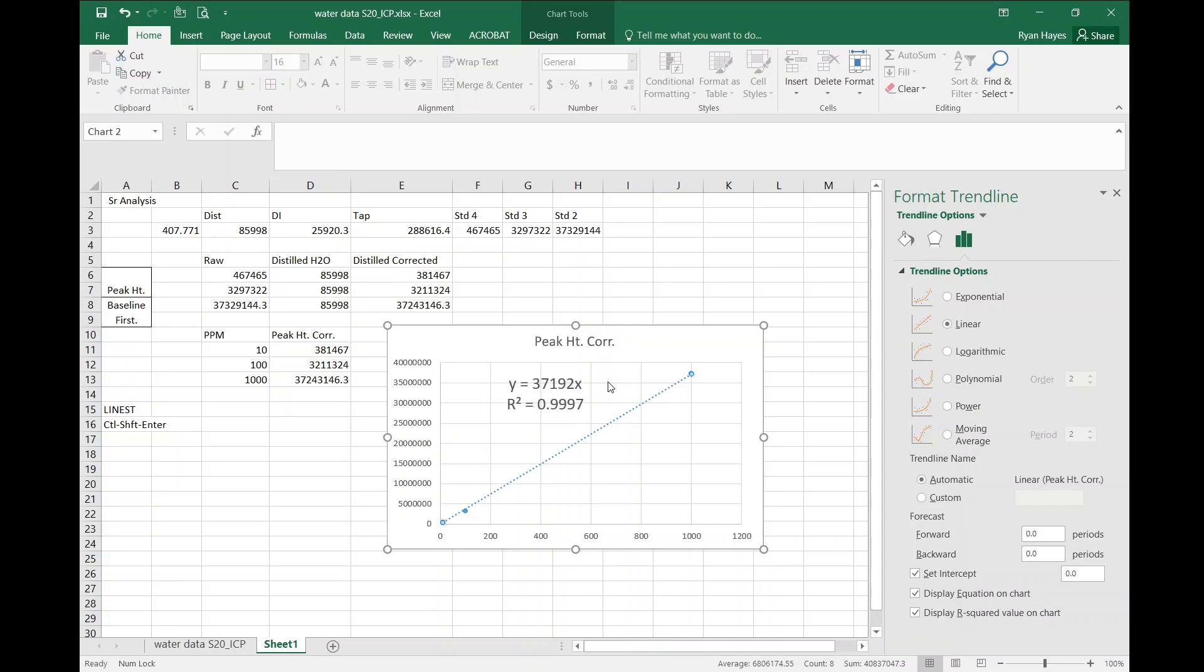Boom! You lose your B term because B is zero. And the R square value, if you look at that, got a little worse because we're now forcing it through a point that's not the best. But that's okay, we want to do that as it will help get some of those lower concentrations.